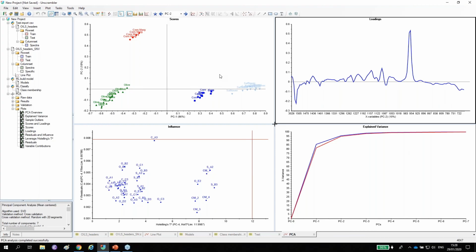Perhaps you would like to have no trans fatty acids. That means that you need to be in this lower area of the plot, and perhaps you like a high degree of unsaturatedness, more unsaturated bonds, because that might be healthier. Then you want to be in this region.